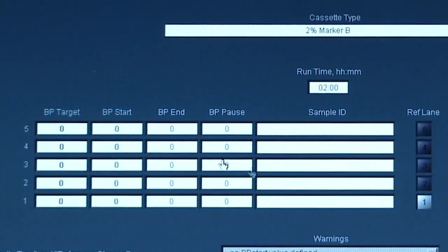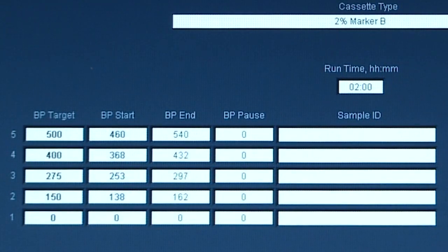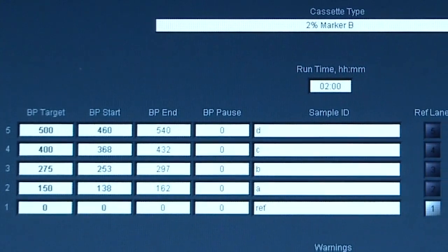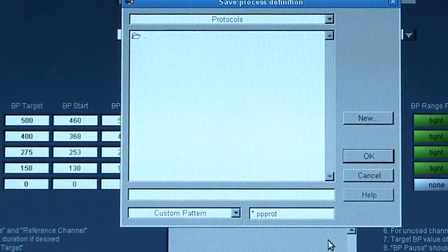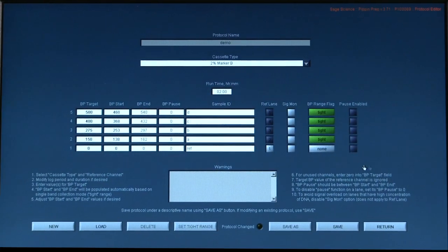Then enter the cut sizes for each lane. Use the Sample ID field to label each lane with your sample identifier. Save the protocol, then press Return to go back to the main screen.